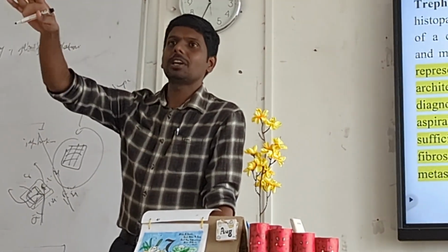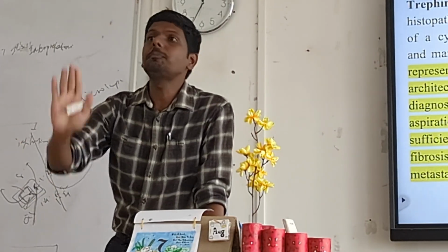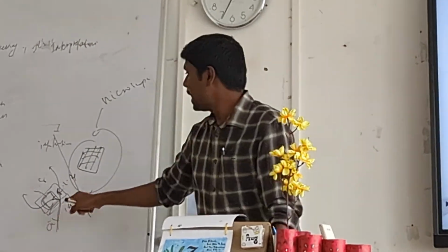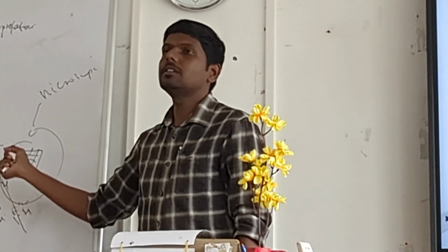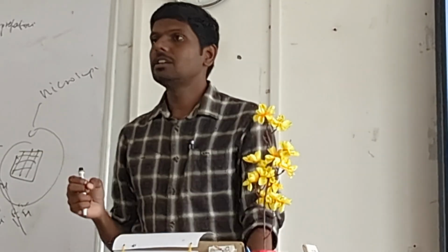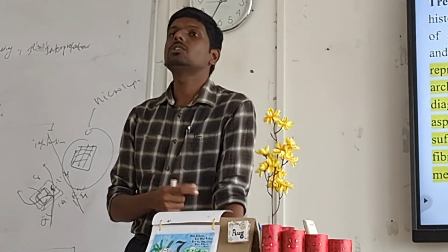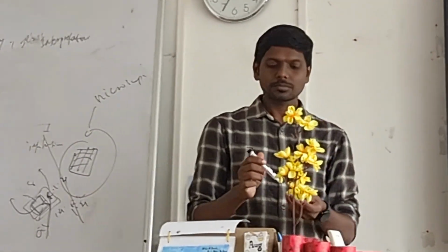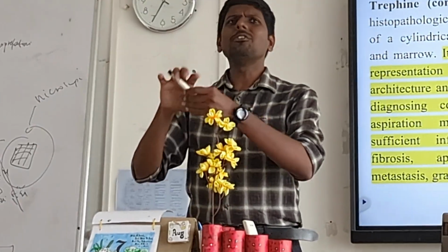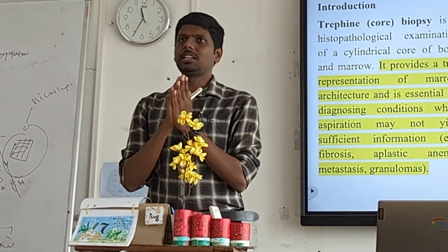You use anything, at the end of the day my tissue should be clear under microscope. The light pathway should be clear. And one of the best RI, glass slide RI reagent is xylene. Xylene has the same RI as glass. That's why we are using xylene as a clearing agent. Okay. Now, slowly what we are going to do is, we replace water with xylene inside the tissue.